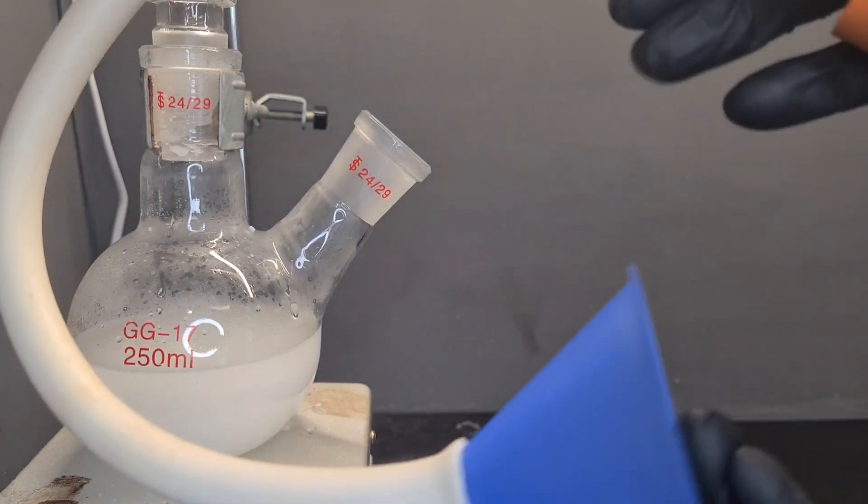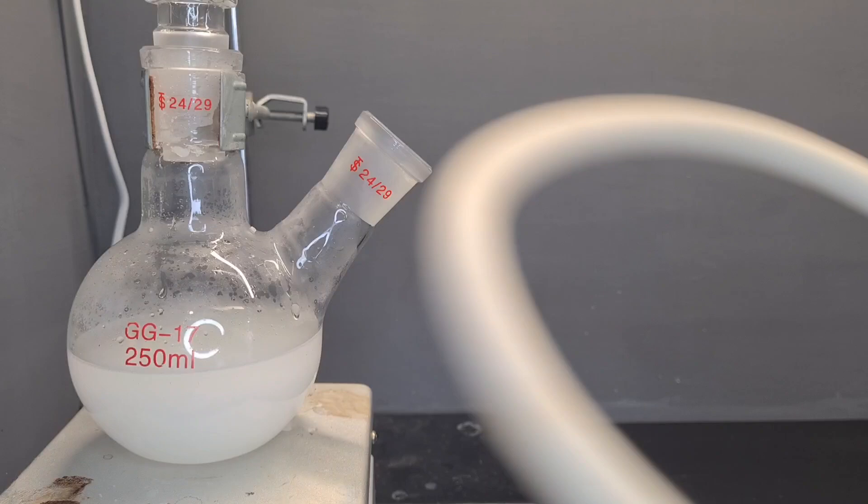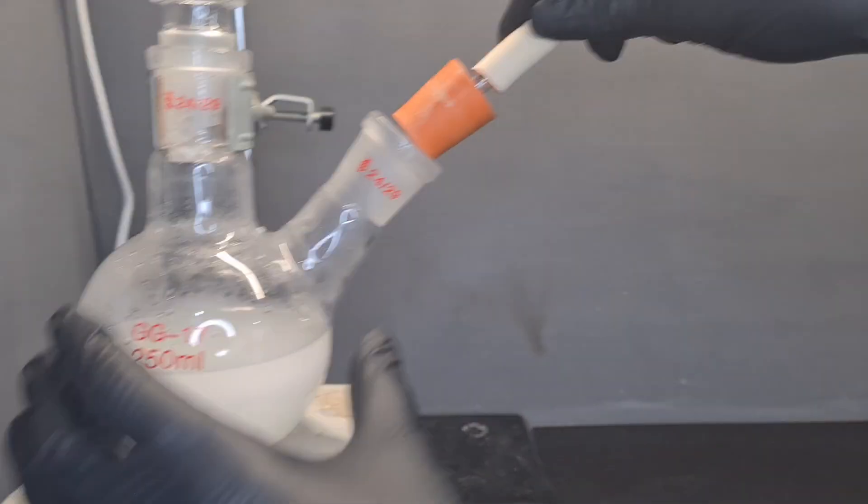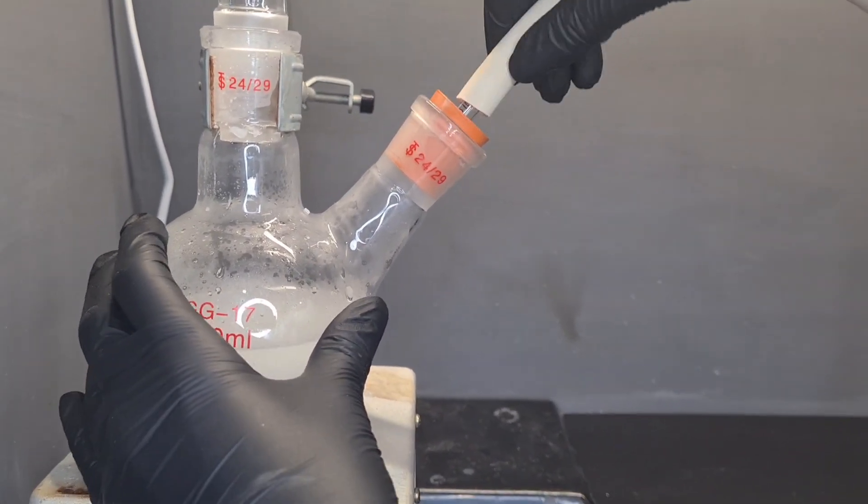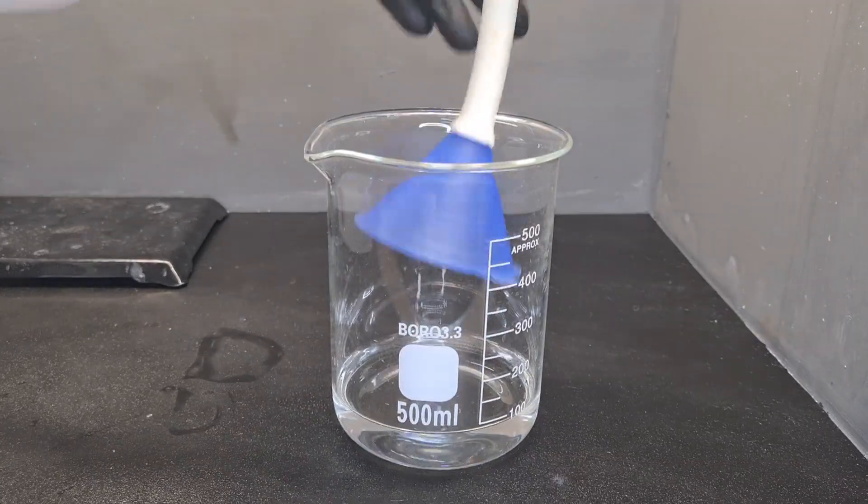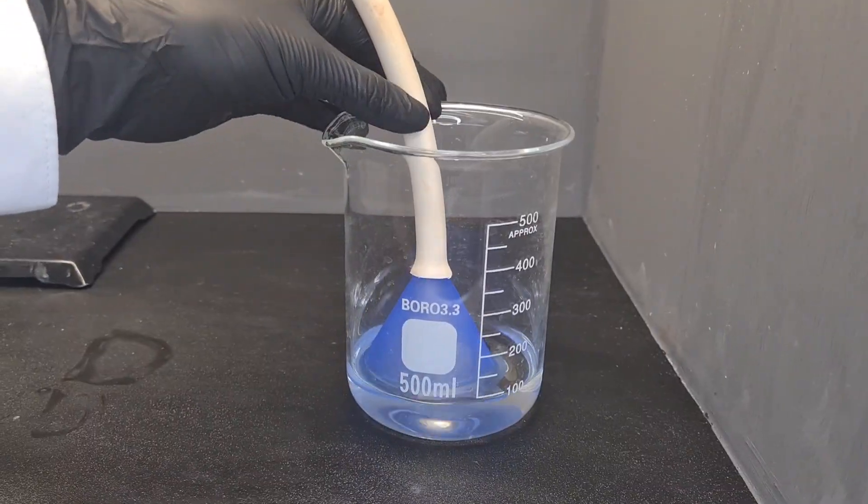Now I'm going to connect a gas bubbler setup. This funnel prevents suckback and allows the ammonia gas to dissolve faster.